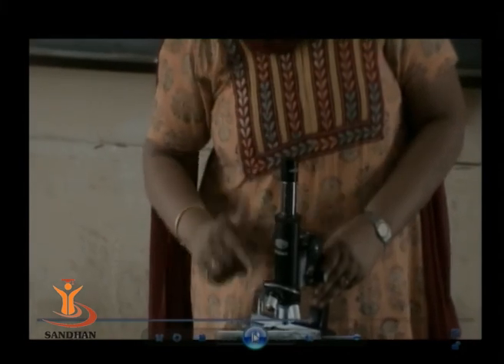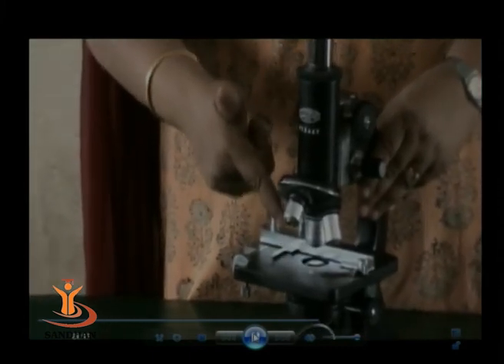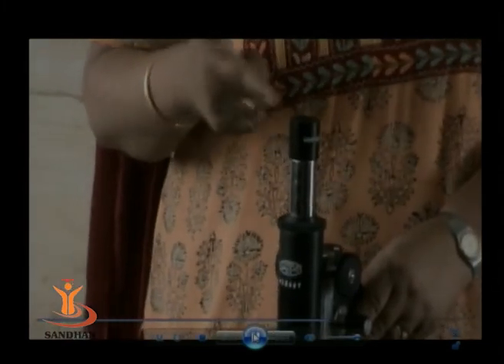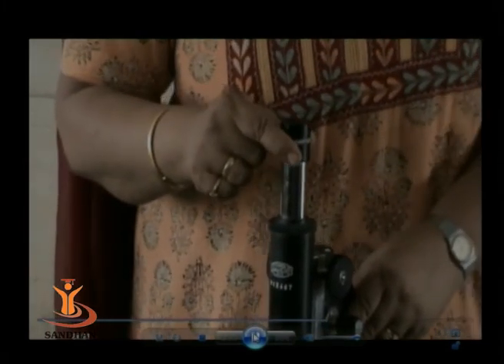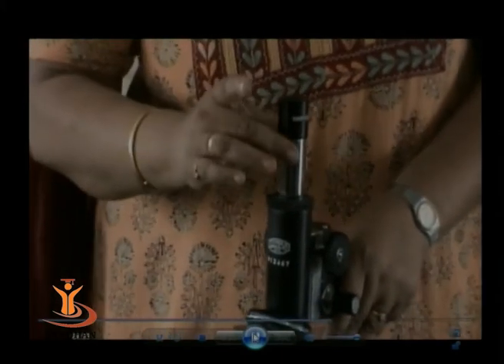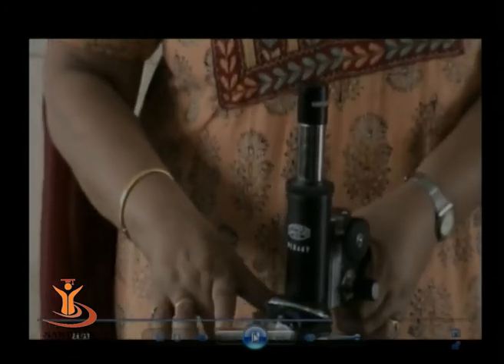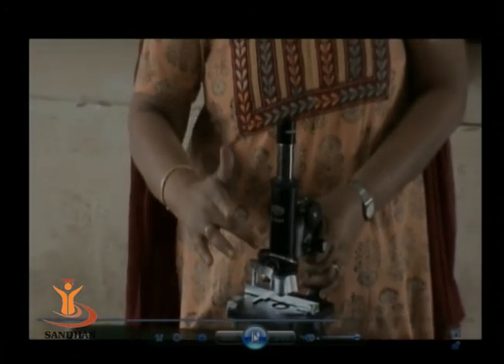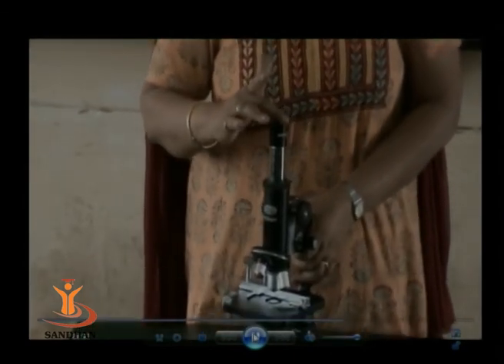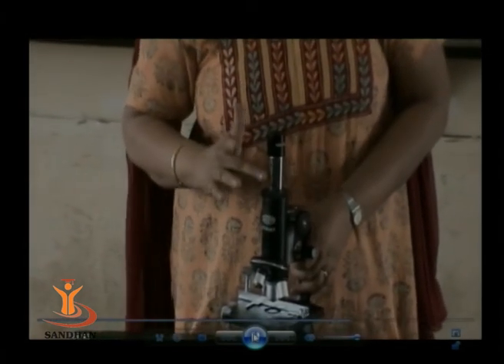The first magnification is achieved when the light rays pass from the object to the objective lens, and the second magnification is obtained when they finally pass through the eyepiece lens. As it is called the compound light microscope, light is the source. Why is it called compound? Because the total magnification achieved is the multiplication of the magnification achieved by the objective lens and that of the ocular lens, and that is why it is the compound light microscope.